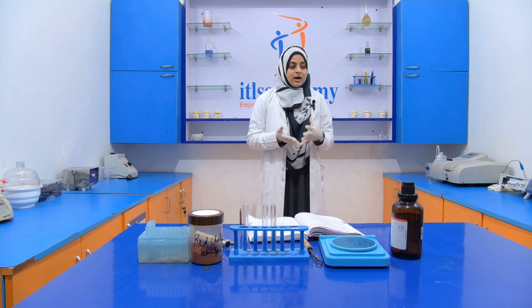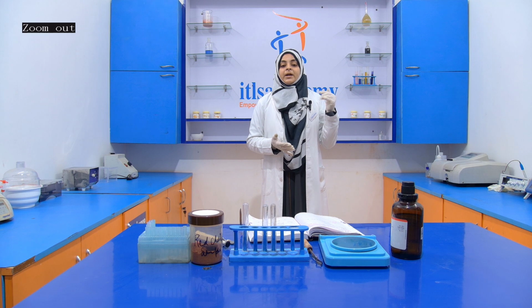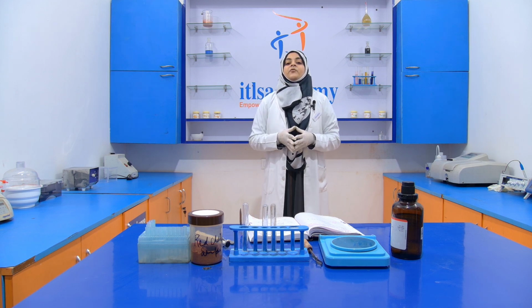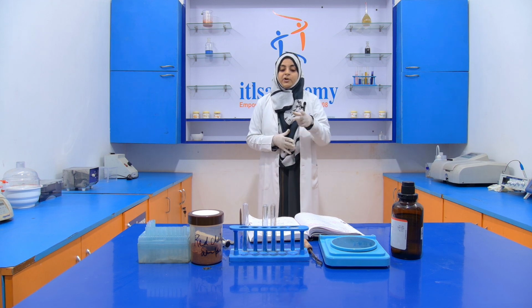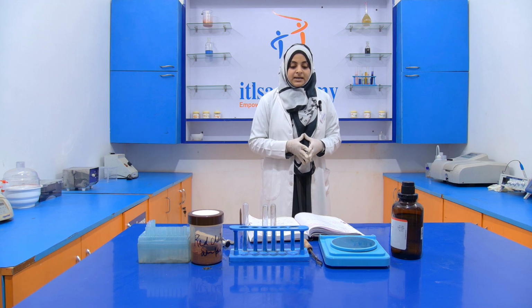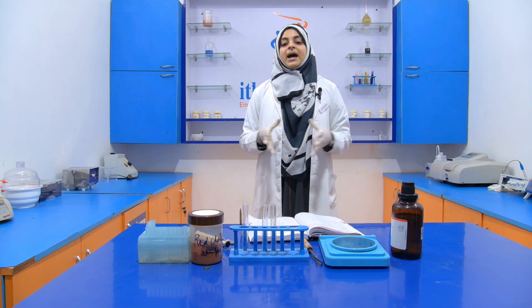Okay, like how much artificial color can be added into the food product, and what is the permitted level. Even some food colors are banned by the FSSAI, like rhodamine B, because it is carcinogenic in nature and it is also a neurotoxic dye.